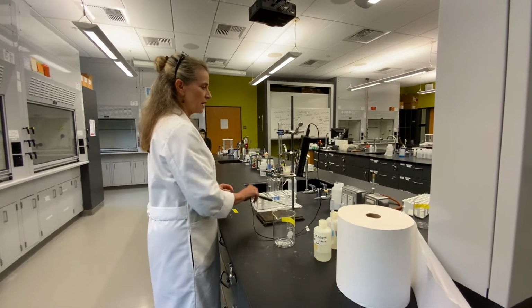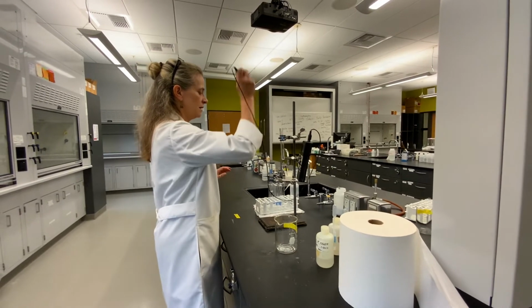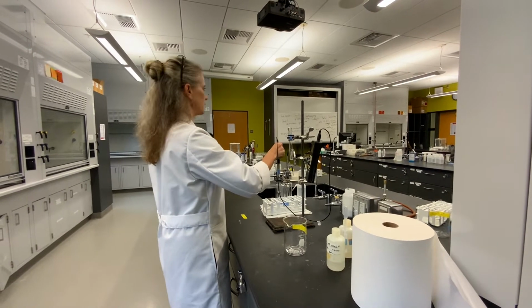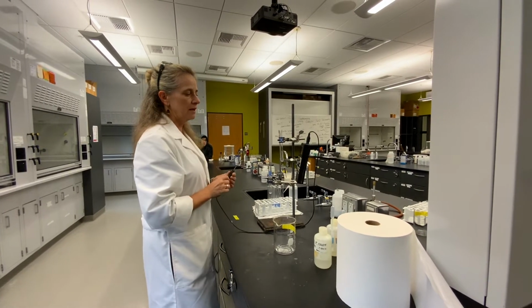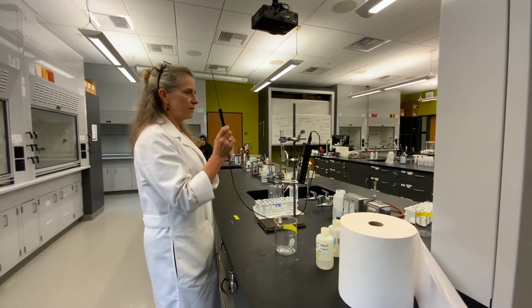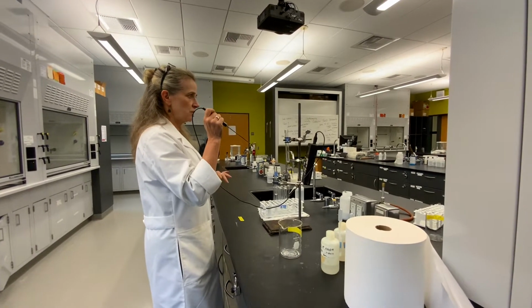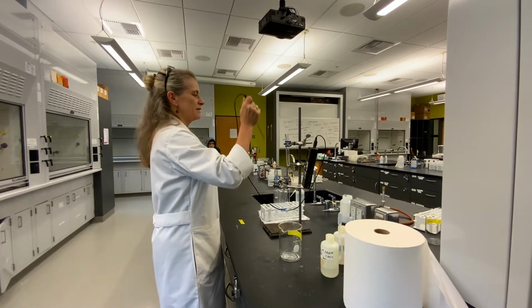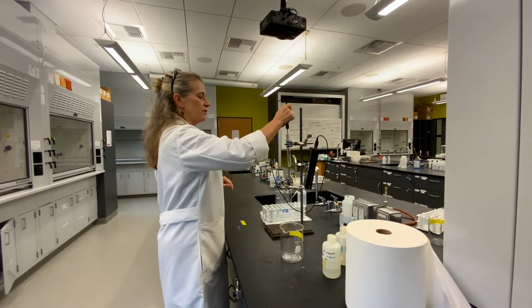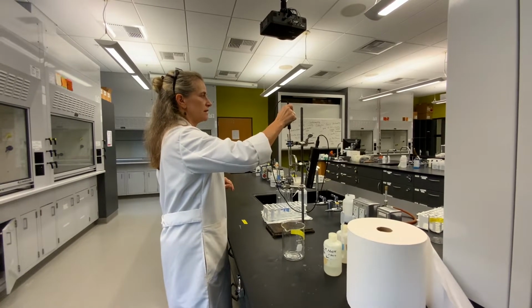I would encourage you guys to take the temperature of each of them before you start. So take the temp of one, take the temp of the other so that you can at least see what that is. And I bet they're going to be about 22 because that's about room temperature. Tell me again what the appropriate protocol is for taking temperatures. Did you not catch that? I said it once, I probably didn't say it to you guys. It goes in the center of the liquid, not touching the glass, right? That's the best policy for taking temperatures.